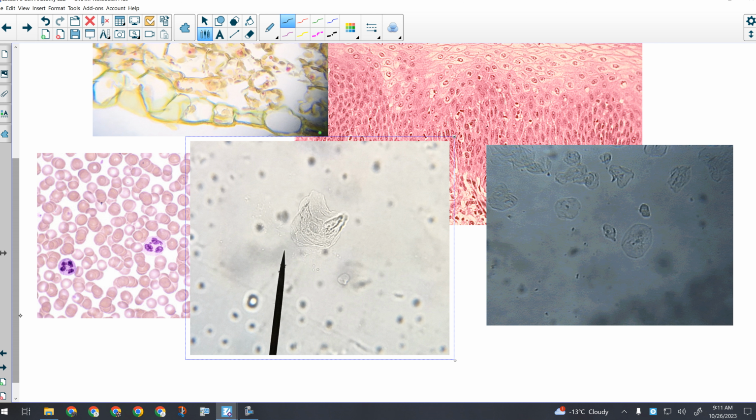And if you move that tab, it closes off an iris inside. If you close that off a bit, it actually increases the contrast of what you're looking at. So it accentuates the difference between light and dark on the image, and it can help that cell to pop. Okay? When I first found this cell, I barely noticed it was there, and then I closed that iris off a little bit and it just popped right out. Okay, and it was quite obvious to see.